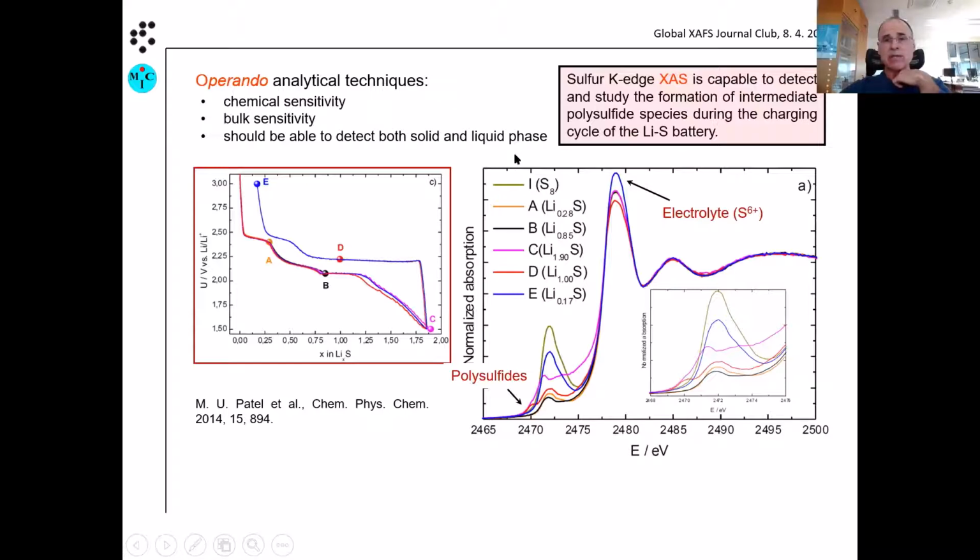And as you may have already noticed, absorption in the tender range is more commonly available than emission. So there is a lot of work on absorption, and you can see there are many references. Typically, this is taken from one reference from our group, from our chemical institute. And this is a typical spectrum, for example, on a lithium sulfur battery, just to give you some idea.